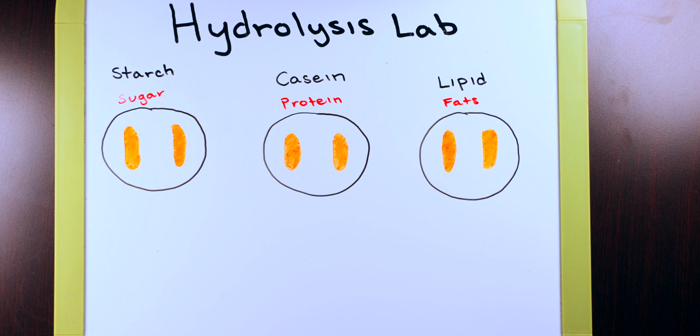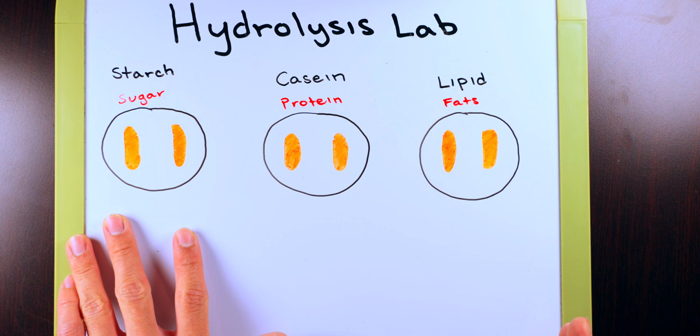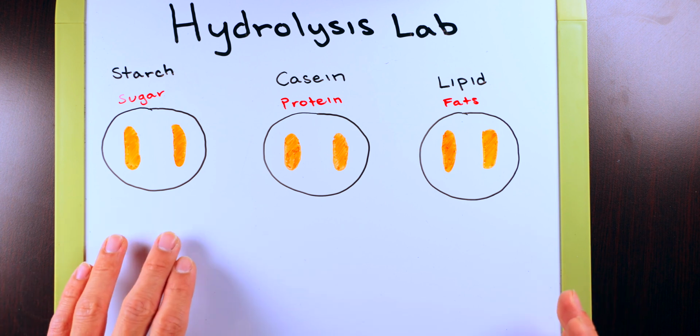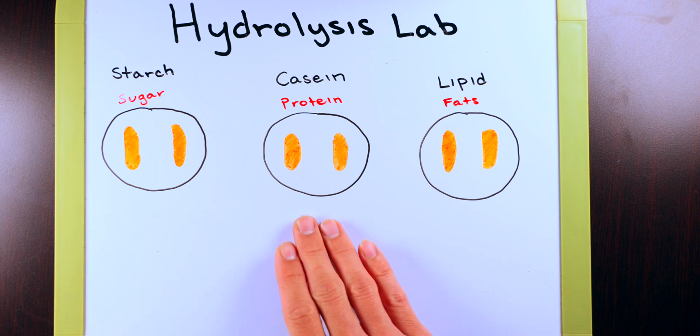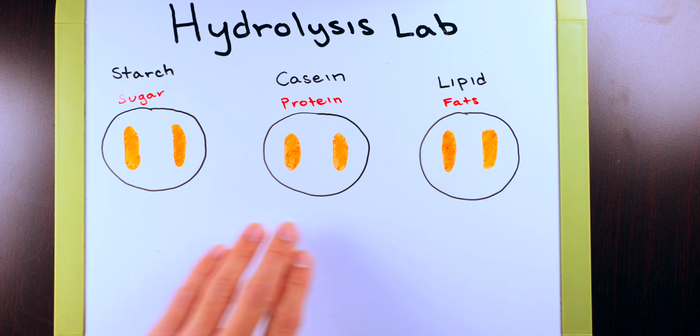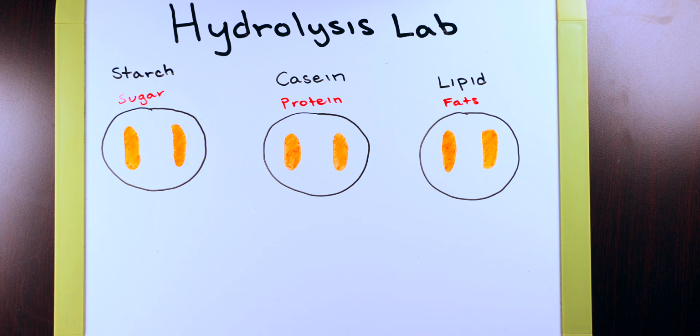But this lab on the first day that you have your plates is relatively simple. All that you'll be doing is simple linear streaking of 2 different bacteria on each of the plates on opposite ends of the plates. Make sure to really do this on opposite ends of the plate. That way, there's no cross-contamination between the 2 bacteria. And carefully label the plates as well. That way you know which bacteria is which, because things could get moved around in the incubator.